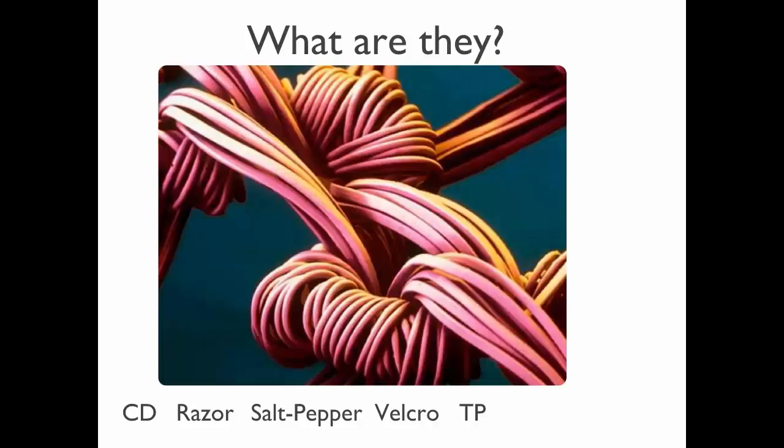No, nobody ever knows this one. Or even when I tell you what it is, nobody knows what it is. I think I know. Rubber band. Looks like rubber bands, and it's similar. These are nylon stockings. Those stockings that you might wear, like under a skirt or something. They're made of these strands of nylon.